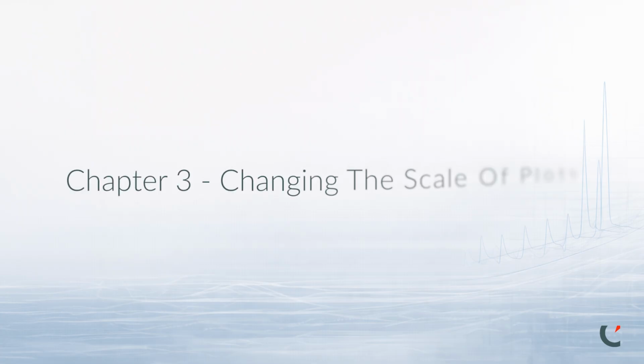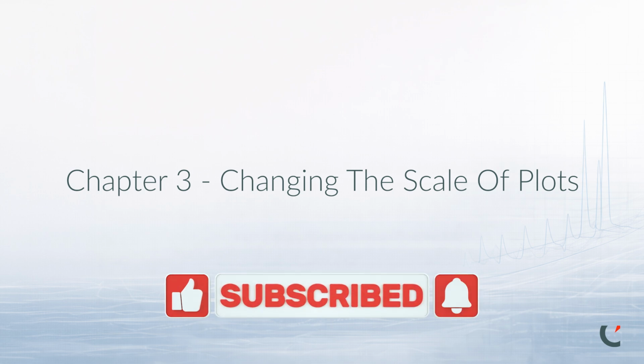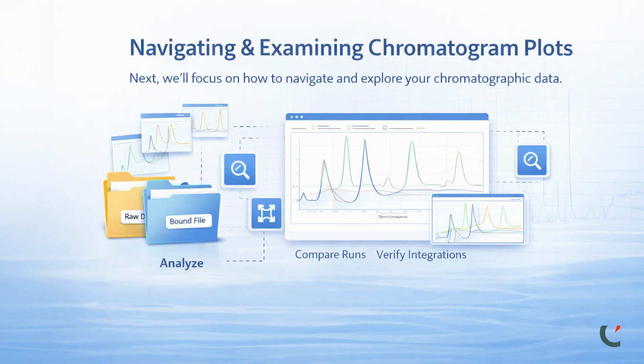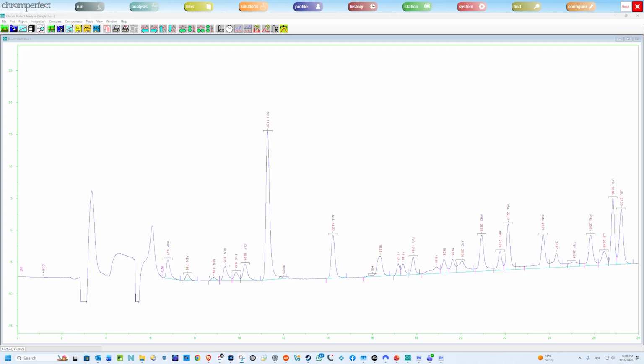In this chapter, we will move deeper into the chromatogram display itself and explore the tools used to navigate and examine chromatographic plots. Understanding how to move around a chromatogram efficiently is an important skill when reviewing data, verifying integrations, and comparing multiple runs. Let's first focus on analyzing a single chromatogram.